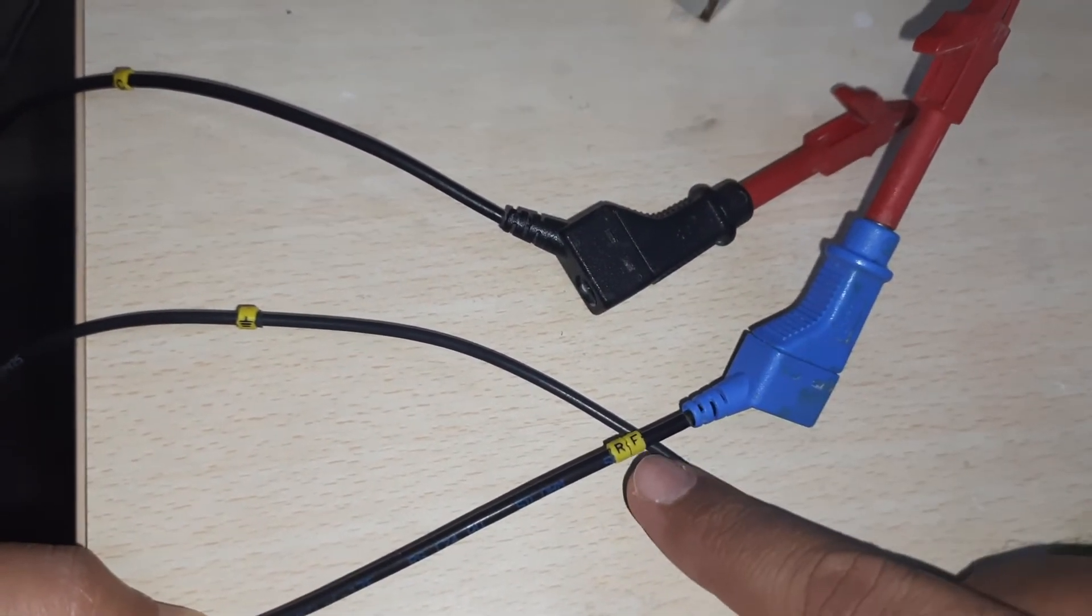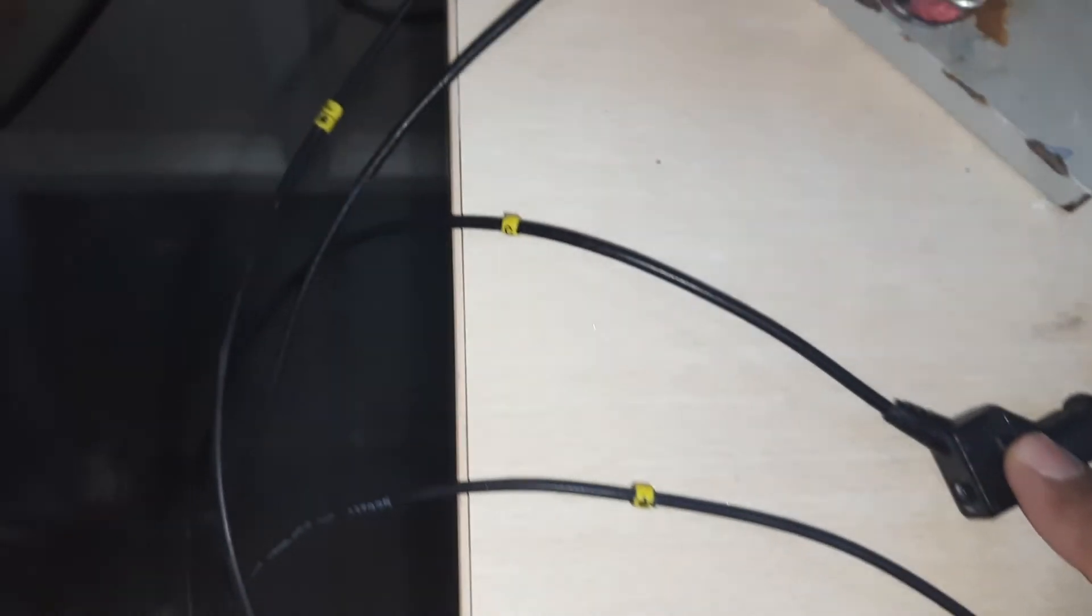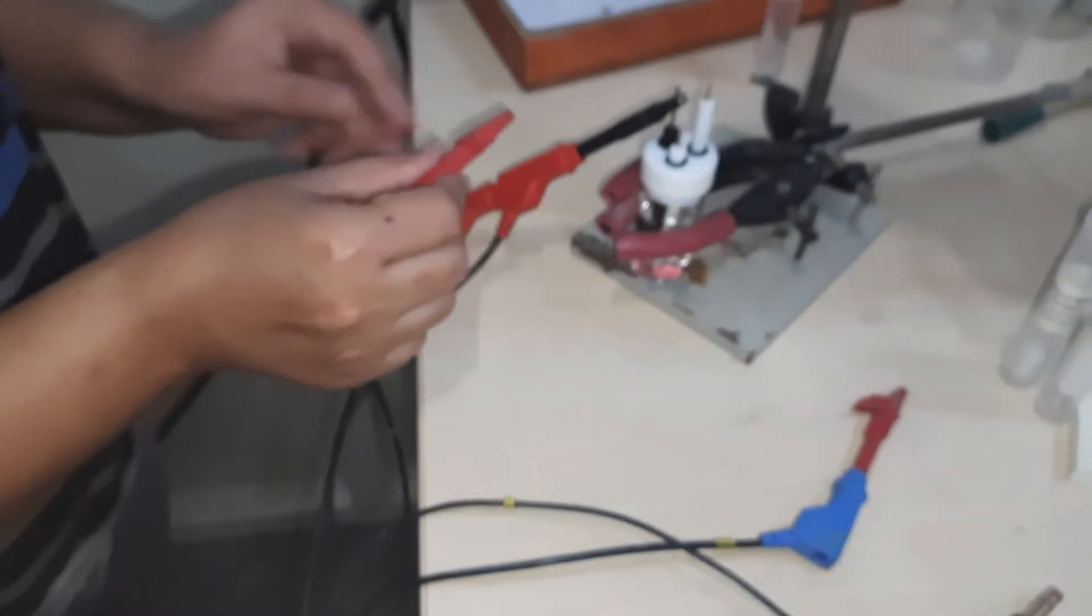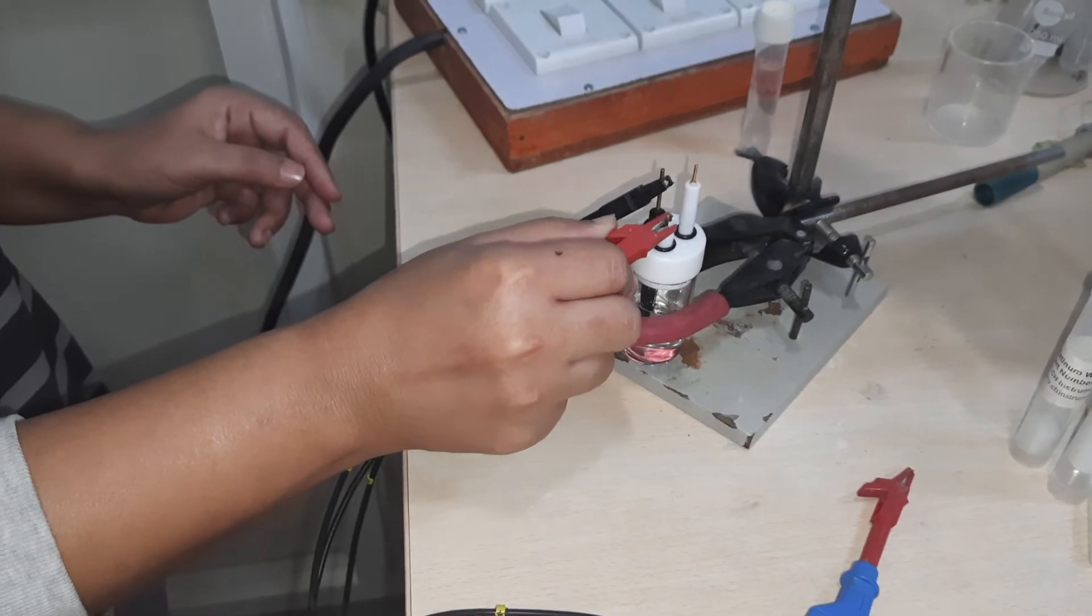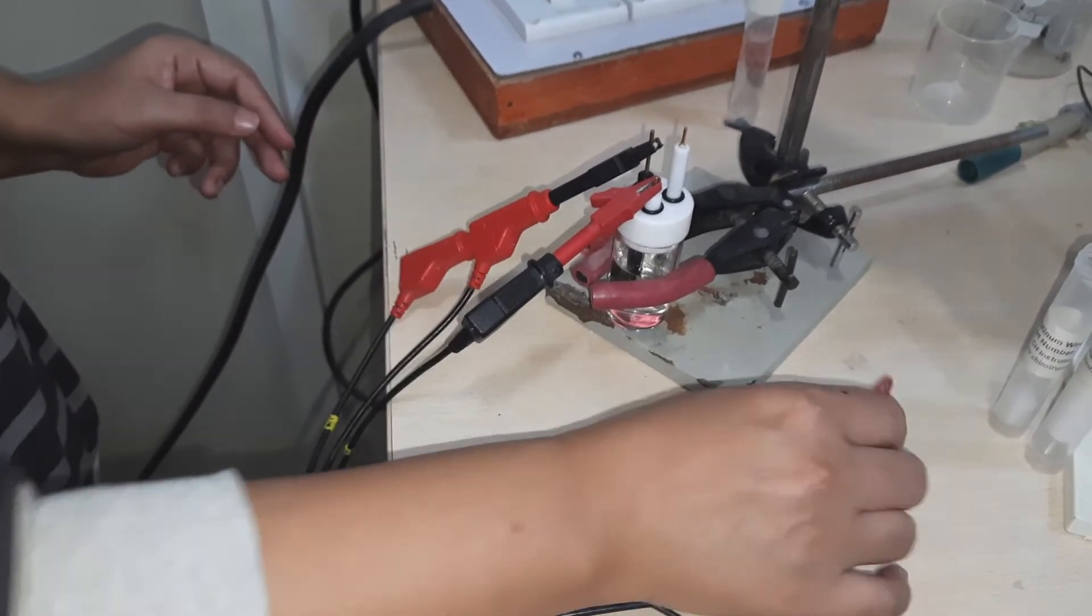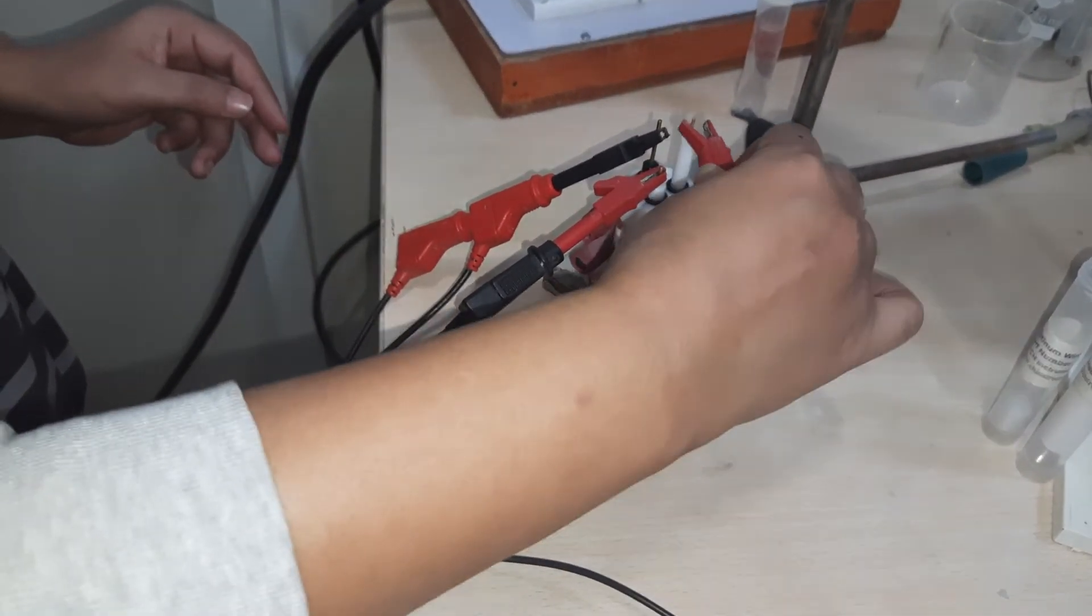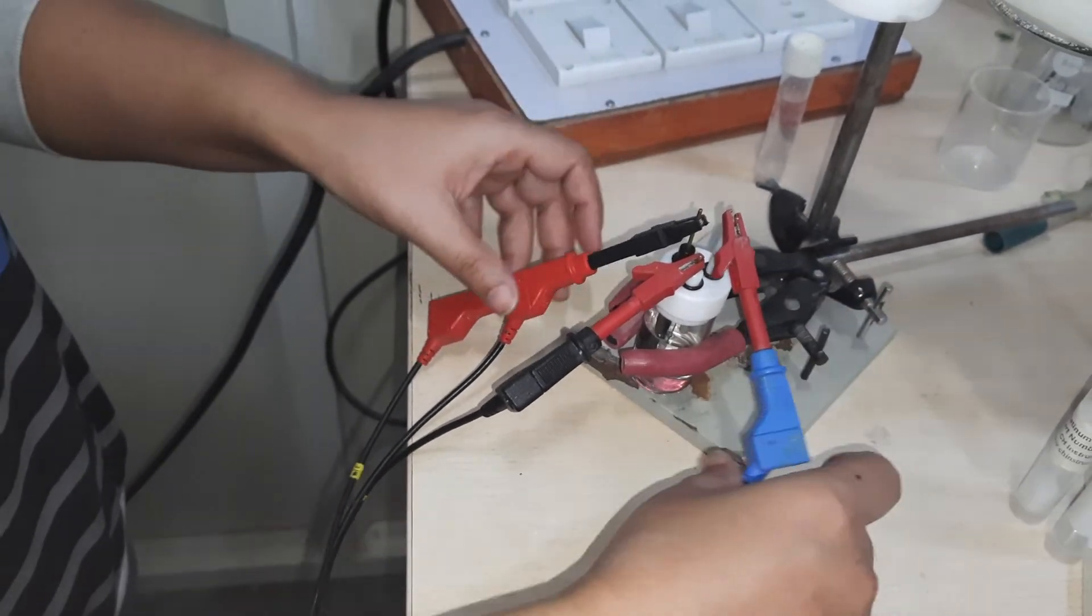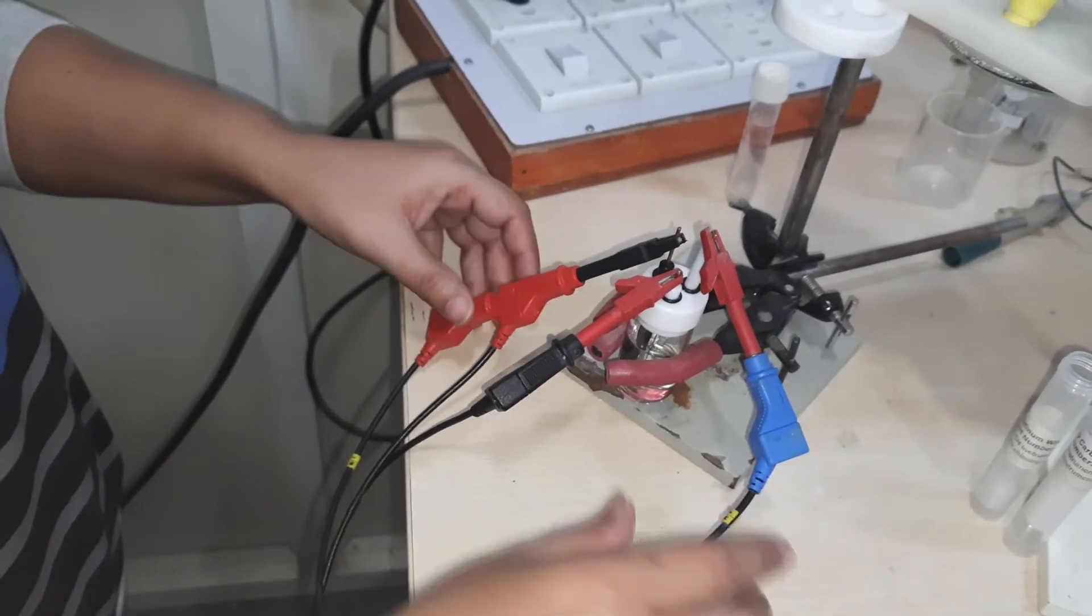As you can see, this electrode is the counter electrode. So how to connect them? You can see this is called a crocodile clip - you just press them and clip them. It's quite a simple setup.